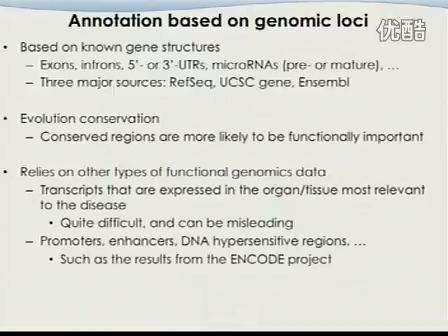But there's another piece of information that most people are not really looking into. There's a lot of data in the public domain, especially the ENCODE project, which generated a lot of annotations for the human genome. For example, the promoter regions, and most importantly, they identified a lot of enhancer regions. The promoter regions are kind of simple: we take a transcription start site, go upstream a few thousand base pairs, and think the promoter region is there. But enhancers can be anywhere in the genome, and the ENCODE project really helps us to map those regions out.